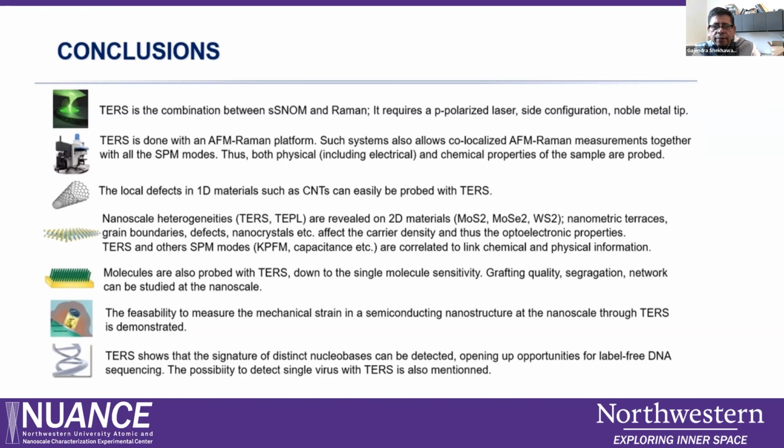Yes, it seems the TERS configuration is like a regular Raman plus AFM, some configuration, right? Yes, it's basically an addition to the current Raman. So if, for example, nobody uses the TERS, the rest of the system can still be used as a regular Raman? Yeah, they can use it as a regular Raman.